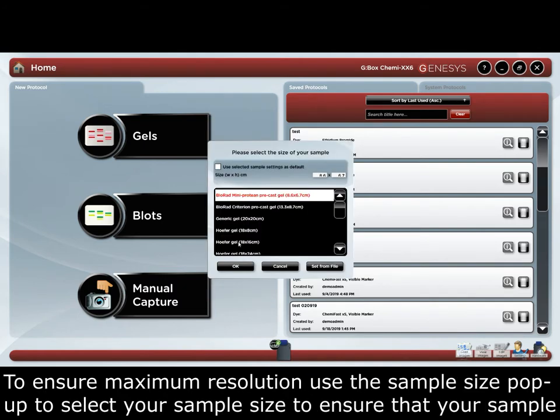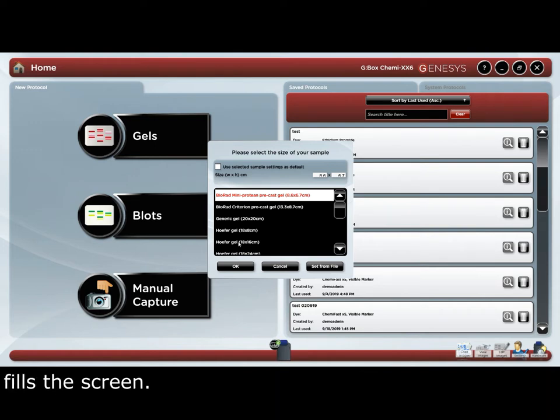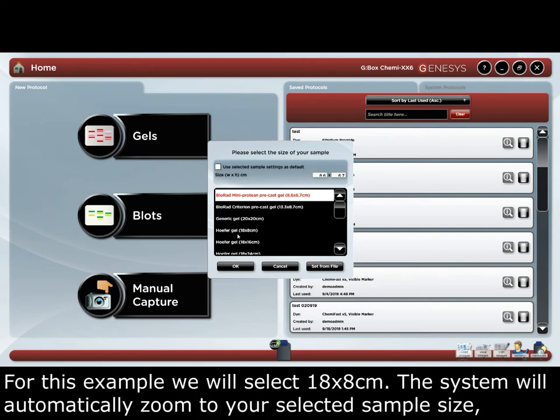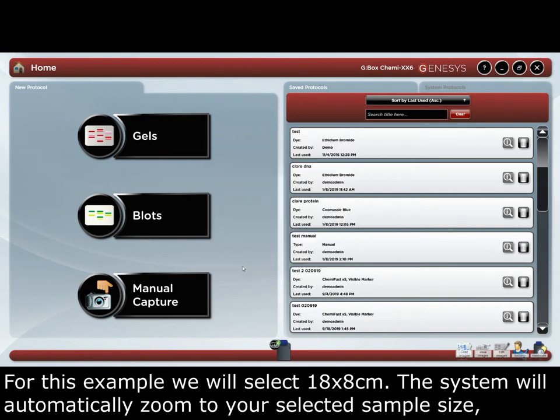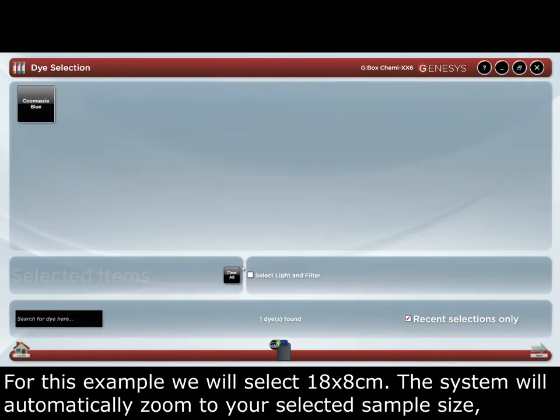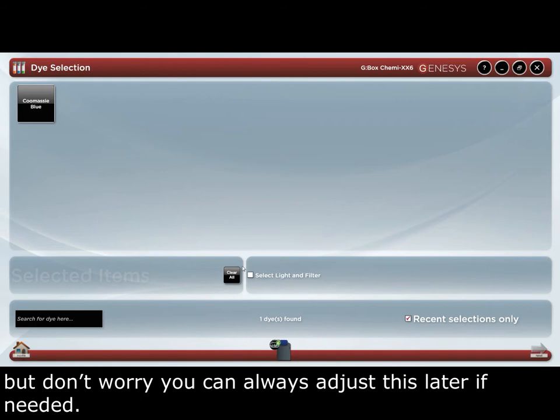To ensure maximum resolution, use the sample size pop-up to set the sample size to ensure that your sample fills the screen. For this example, we will select 18x8cm. The system will automatically zoom to the selected sample size, but you can always adjust this later if needed.